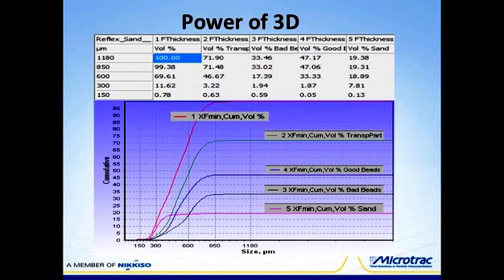And all of this information is obtained from one analysis of the total sample and the creation of the classifications of the different types of particles. And most analyses, again, are performed in less than a minute.